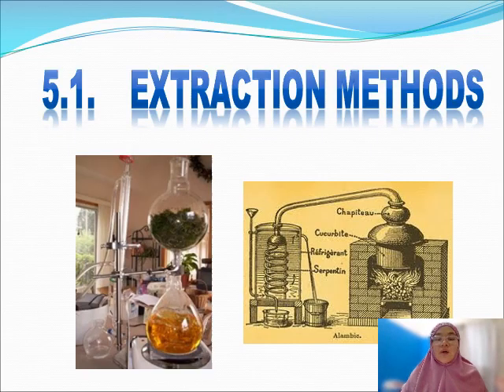So, extraction methods. In biology, we also need to analyze the chemicals inside organisms. We have two types of organisms, animals and plants. To understand the compounds present inside animals or plants, we need to extract the samples.